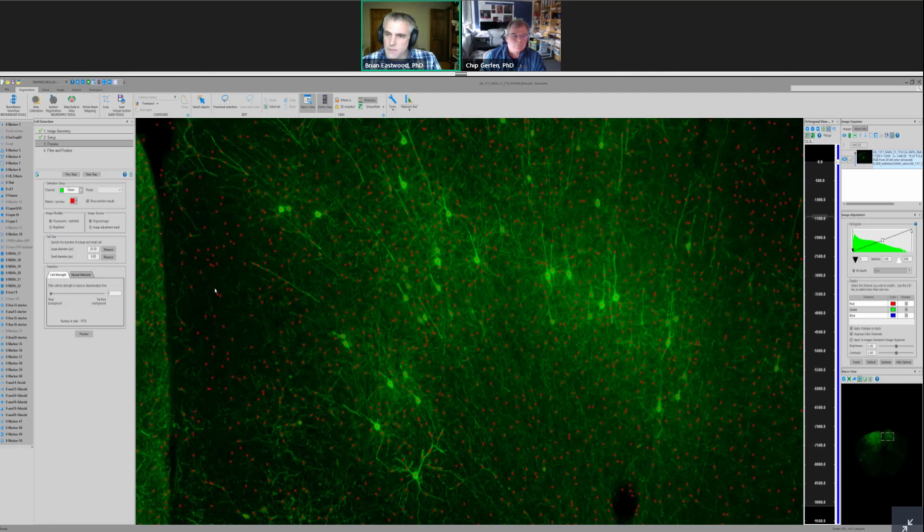The other parameter, I mentioned that we can analyze the size and also the strength of the objects. So there's a cell strength parameter, and that's the slider below the cell size parameter. The mathematical model we're using, the LoG, provides a strength for every object, and that slider filters the results by strength. We enable that slider to go all the way down, basically to 0, because we don't want to make any assumptions about the relative strength of the objects that we're trying to detect. But near 0, most of what we're detecting are essentially patterns in the background noise of the image. And so you can see that.